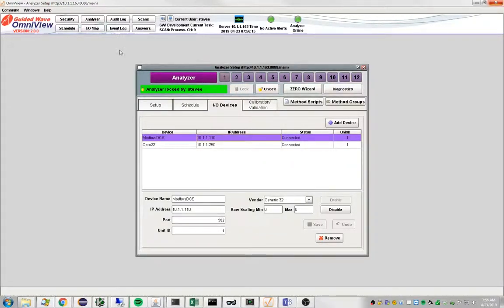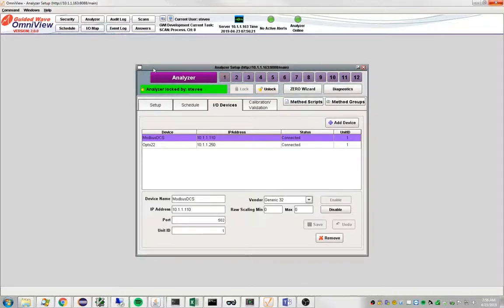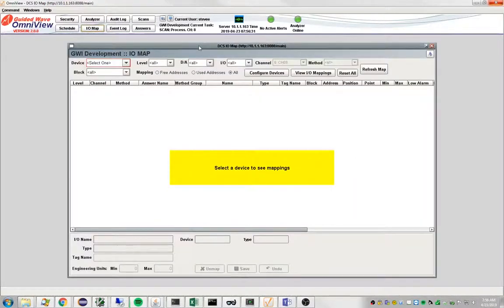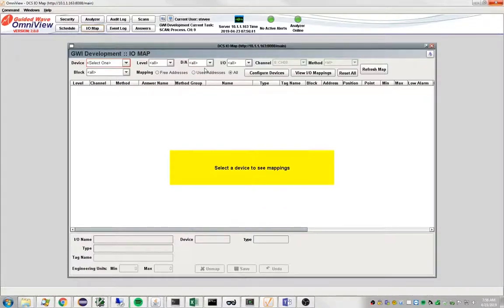The way to get started is again you have to have the lock, the Omniview lock, and we're going to bring up the IO map. The IO map is a way to connect data values being produced by Omniview to the outside world through a device.